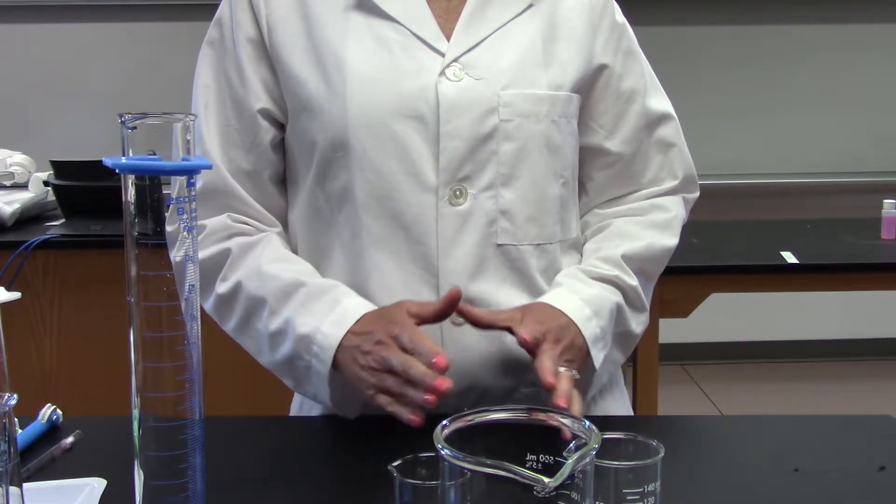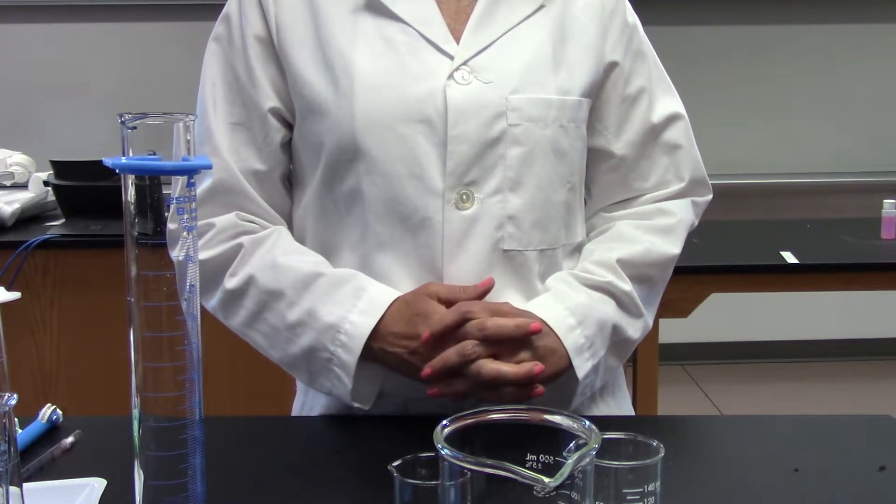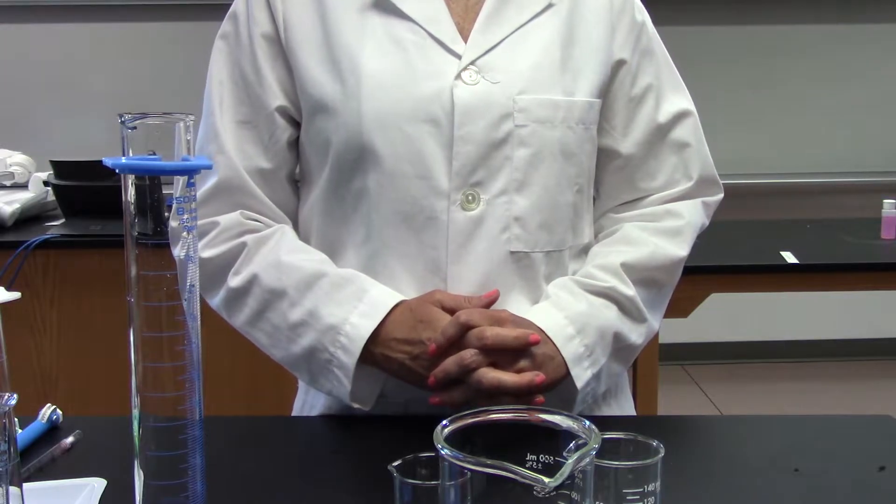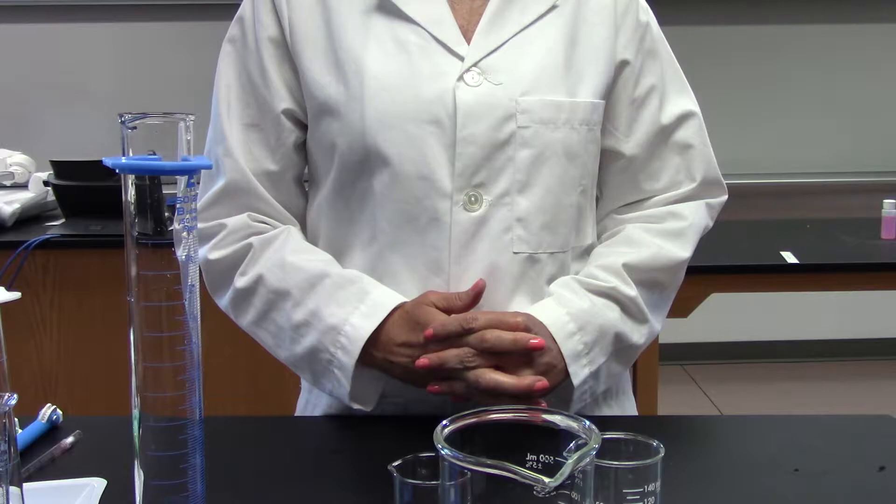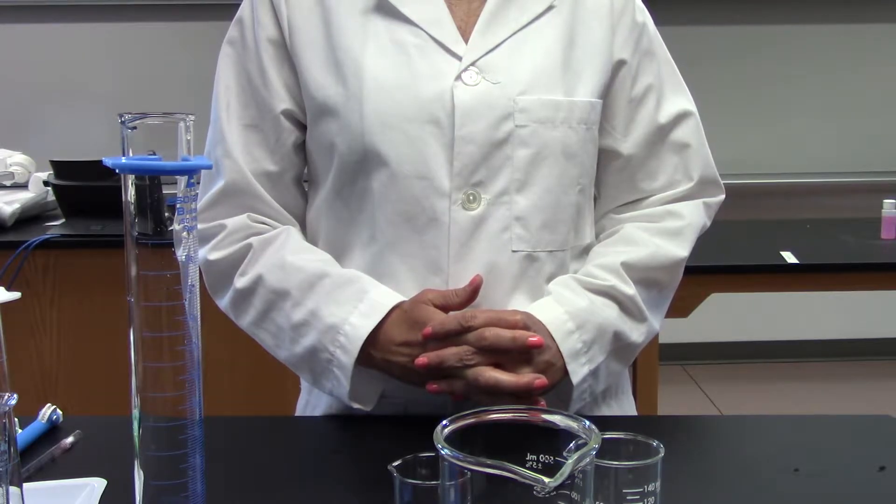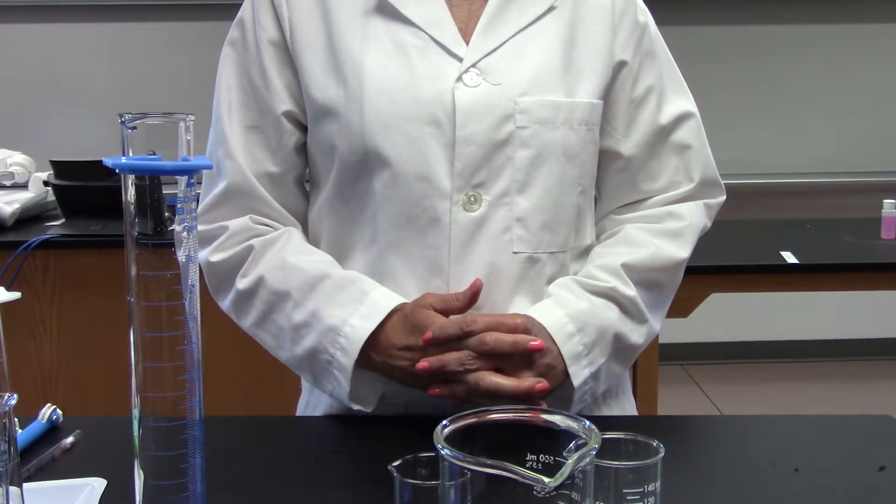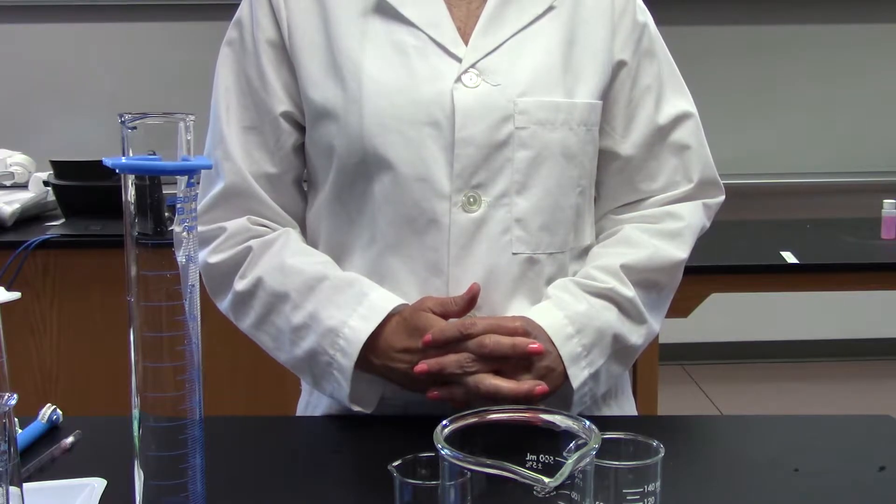So I first want to talk about measuring liquid volume. It's important to realize the different types of glassware that are available in the lab and be able to choose the most appropriate type of glassware depending on what you're doing.